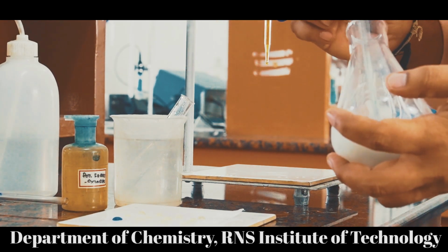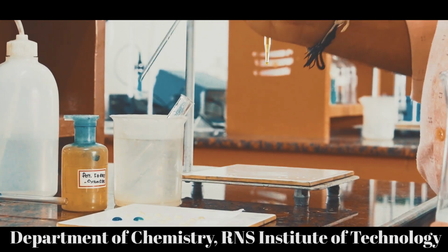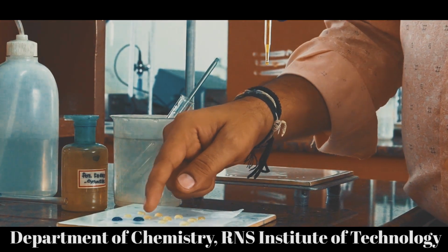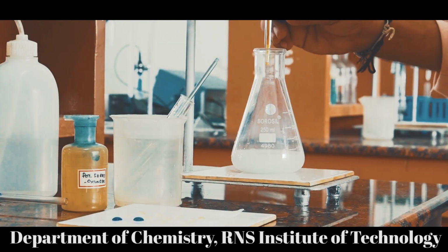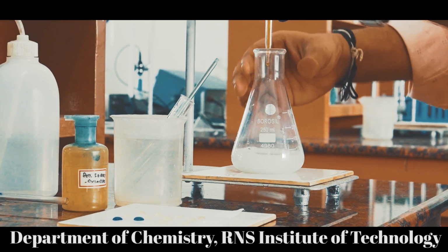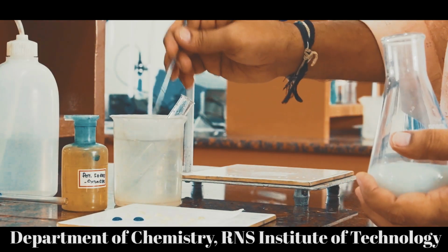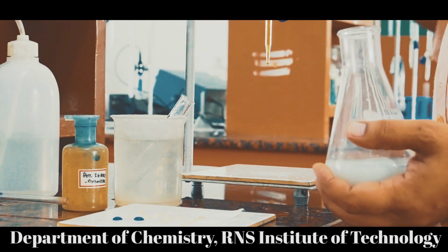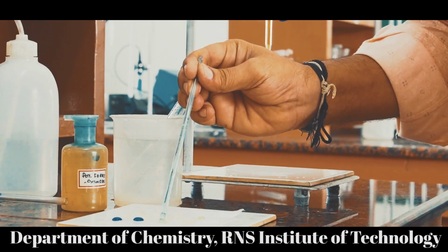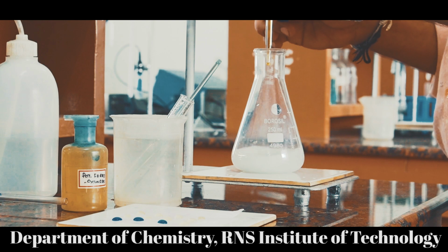So dip this and bring it in contact with the second droplet of the indicator, right? Now let us see, the color intensity of this indicator droplet is reduced from this drop to this drop. Going further, I will add 1 more ml, that is up to 9 ml. Again we may have reached the end point, so we have to check again and again. Wash the glass rod, rinse it with distilled water, dip it in this solution and bring it in contact with the third droplet. Okay. So again it changes, so once again you have to continue the titration.